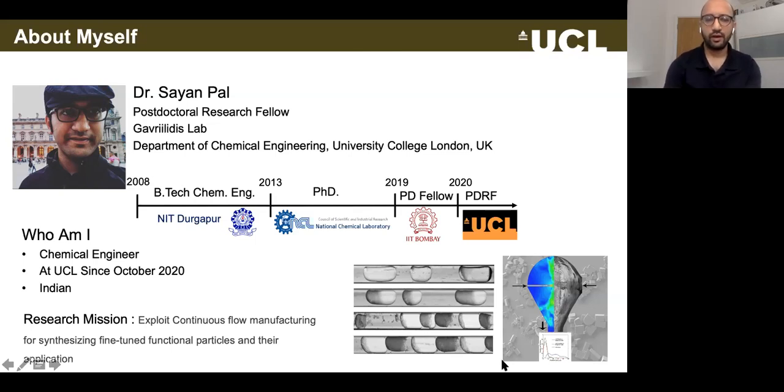My research is mostly focused on particles and how to manufacture them in continuous flow. So different continuous flow reactors, which I have worked on throughout the years to make different types of particles, which have specific functional properties and which we can tune in different ways to make different types of applications.